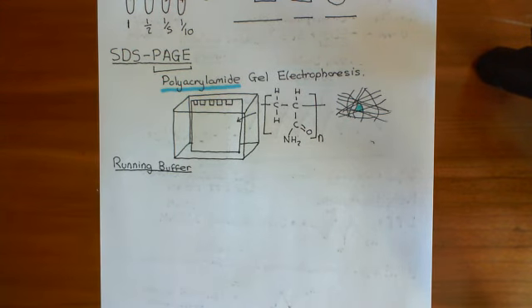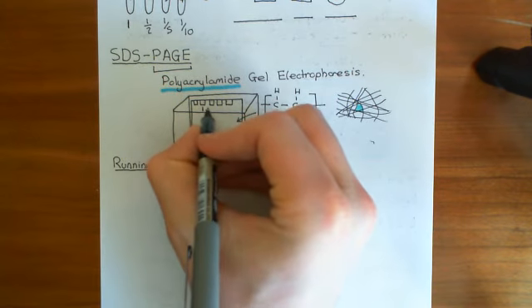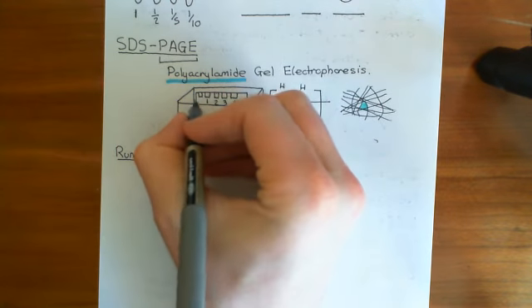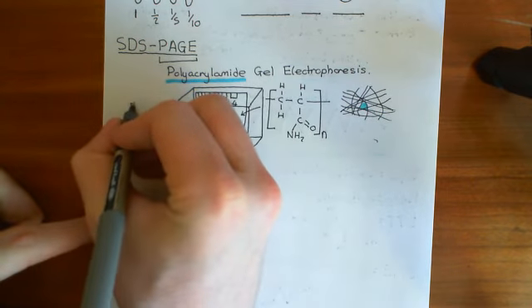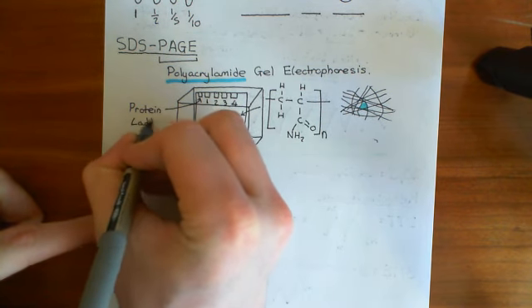So let's now talk about the electrophoresis then. Let's mount our samples. So what we'll do is we'll mount sample 1 into this well here, we'll mount sample 2 into this well here, 3, 4, in some nice logical order. And then this one will be for what's known as a protein ladder. So what is meant by a protein ladder? Well, basically this is to give you some idea of what this actually means.